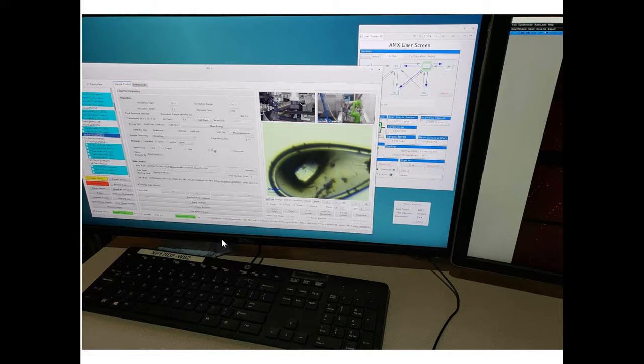When you do this, you get a crystal. And you harvest the crystals. We fish them out using these little microscopic loops. The loop is basically made out of a monofilament, kind of like fishing line. And the goal of this is that you scoop the crystal, right? Here's the crystal right here. You scoop it up with this loop, and sometimes other junk gets in there too.